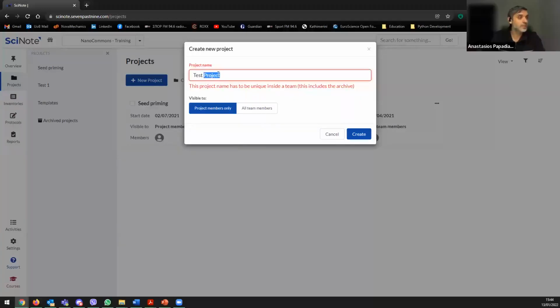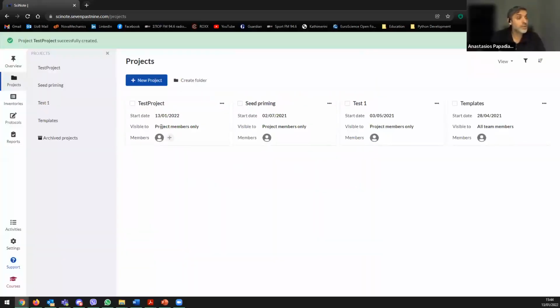And then you create a test project. As you can see, you cannot use the same name for the project twice, which is very good, because when you have to search for a project, you can then adopt a certain way of writing things, so that you have a good overview of what is happening.